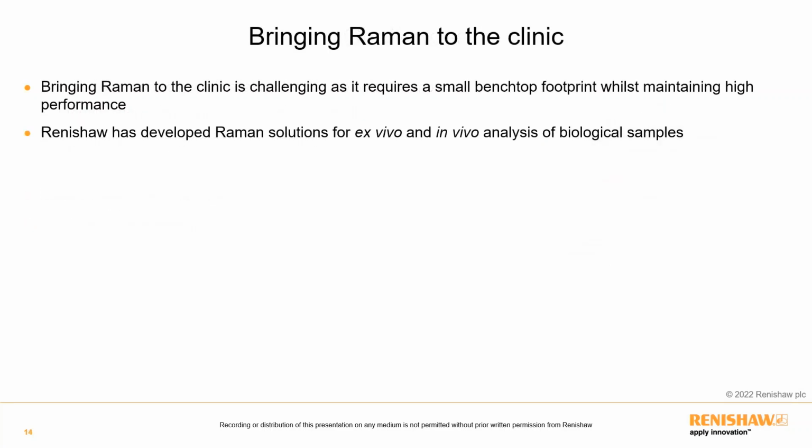Bringing Raman to the clinic is a challenge in itself. The ultimate aim as researchers working in disease detection is that this can be applied directly to the patient for automatic disease detection. Bringing Raman to the clinic would facilitate rapid analysis of tissue and biofluid samples without the need to send it off to the lab. It would allow real-time information to be generated and allow for faster disease detection during biopsies or surgeries. This would provide additional support for early disease detection.